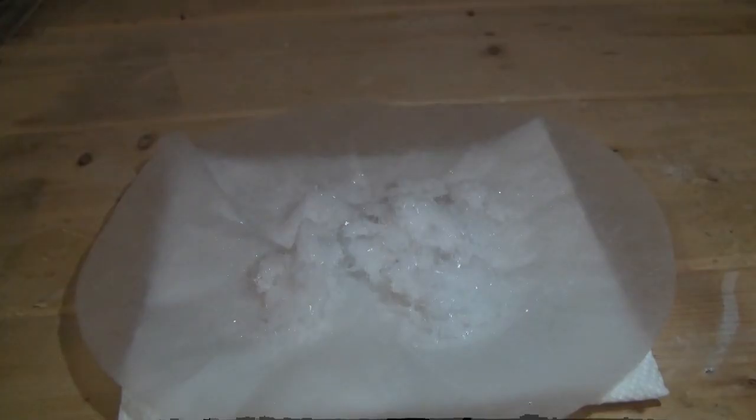Once chilled, the crystals were filtered and allowed to dry on the paper towel for a few hours. The final yield was about 12.214 grams, which correlates to a percent yield of about 69.6%.